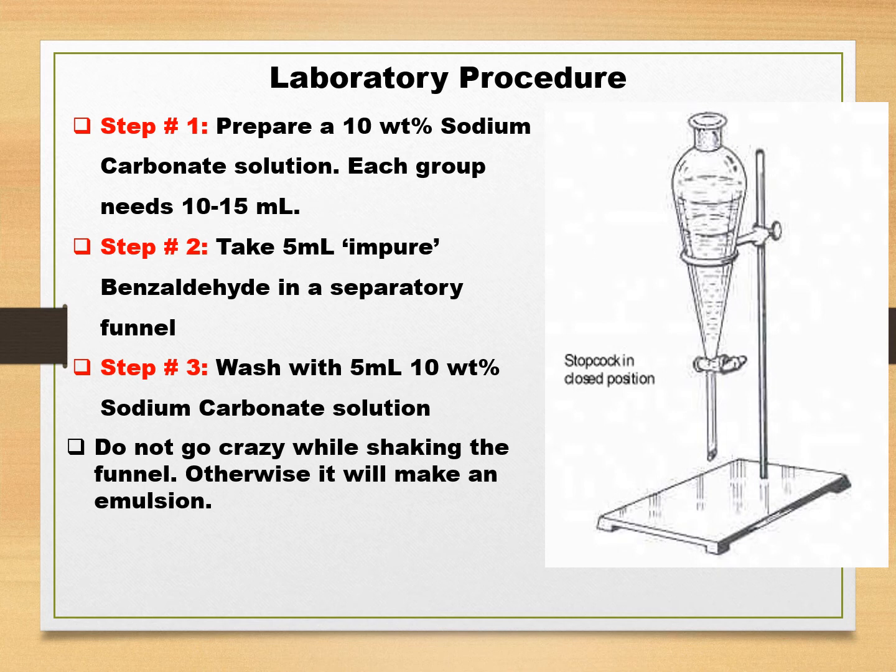And to assure an efficient reaction, we have to shake the separatory funnel, but shaking should not be overdone, which may result in making an emulsion, and that emulsion may prevent us from getting a clear layer between these two immiscible liquids.